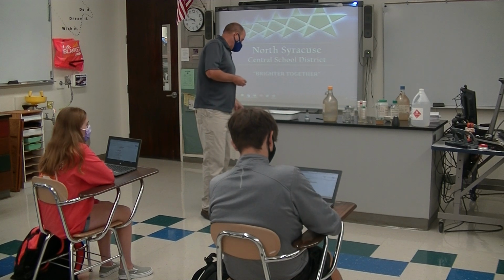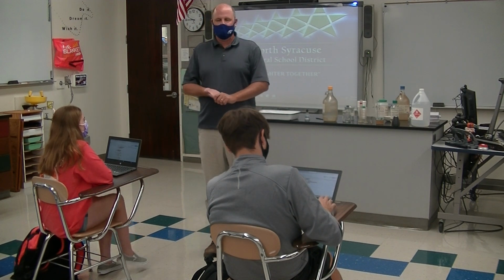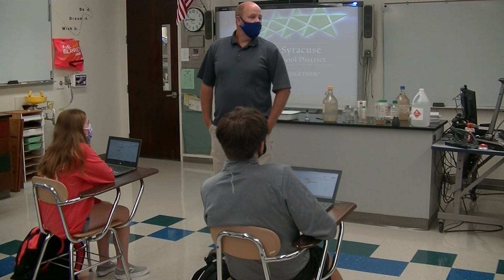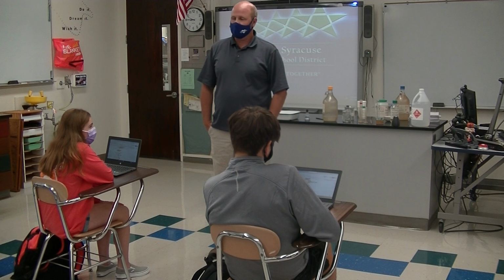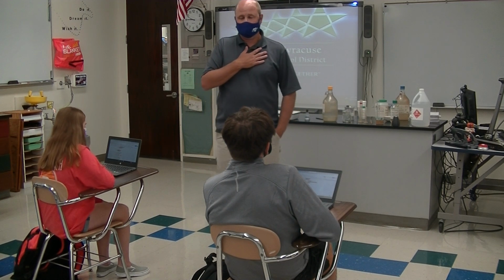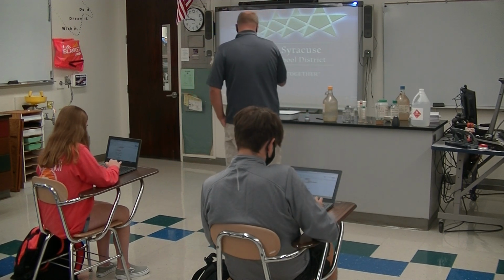Okay. All right, organic solvents. Have you guys ever heard of things being organic? What does it mean to be organic in terms of chemistry? That's the biology term. Organic substances are alive, or once alive. Organic substance in chemistry terminology means they contain the element carbon. So organic solvents must contain carbon.